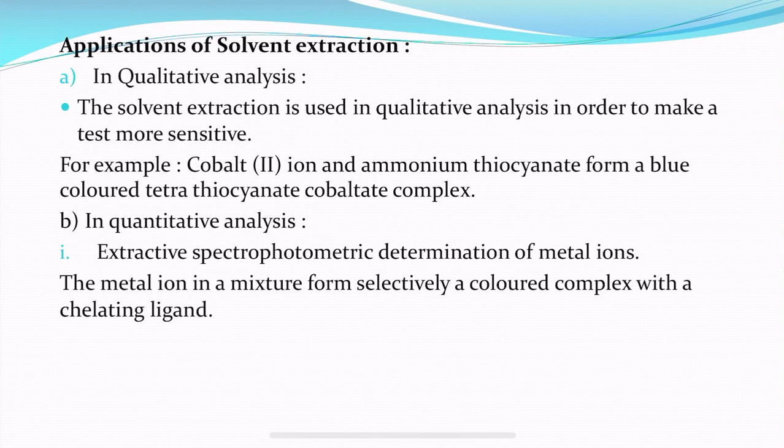And next, moving on to the applications of solvent extraction. Mainly we can classify the applications into two different classes, that is, one is qualitative analysis and another is quantitative analysis. Okay. What is meant by qualitative analysis and quantitative analysis, we have seen in this unit. The initial part of this unit explained what is meant by qualitative analysis and quantitative analysis. Okay. So, now we will see the applications of solvent extraction in qualitative analysis.